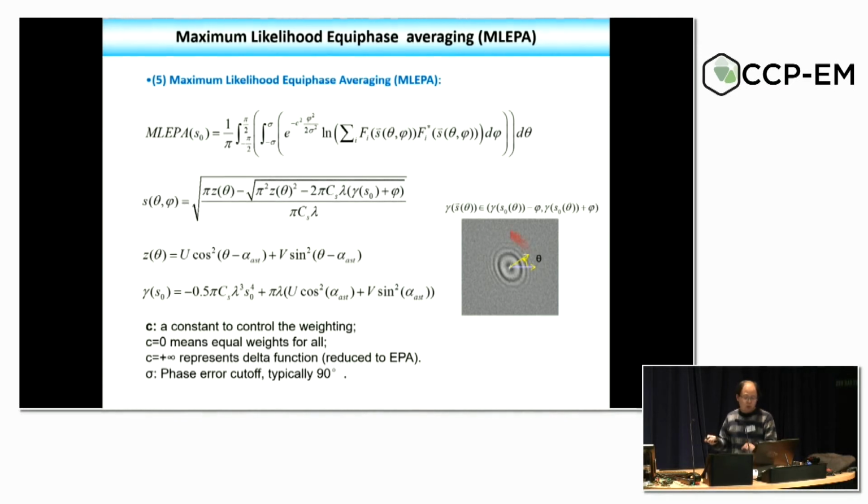And we don't do a single contour averaging, but allow a slightly wide range of averaging by some kind of weighting, assuming there is a distribution of the error, like a Gaussian, and then you average all the power spectrum in this region.